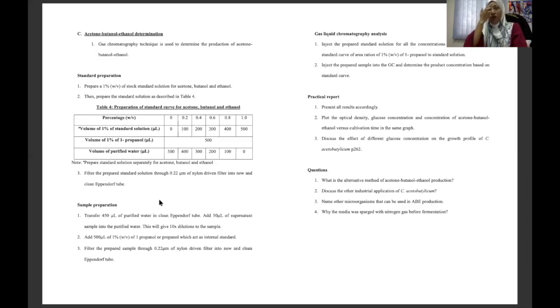Usually for the advanced instrument, the concentration that is required is actually very, very little. You don't have to inject very much or a very high concentration of the sample. So the dilution is usually required. So here you need to dilute.